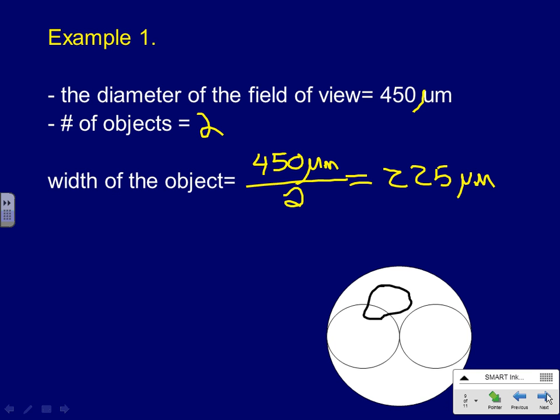For this where there's just 2, yeah, I would say, you bet, 2 fit perfectly, 225 micrometers. But if I'm saying it's about 3.5, then I might not say 225, I might say about 230. You see what I mean? And that's where we're really estimating. If you were to write 3 digits, I wouldn't mark you wrong. I would say that's a good calculation. But in reality, when you do an estimation, you really lose out on the exactness of your number because you're just kind of guessing. All right?